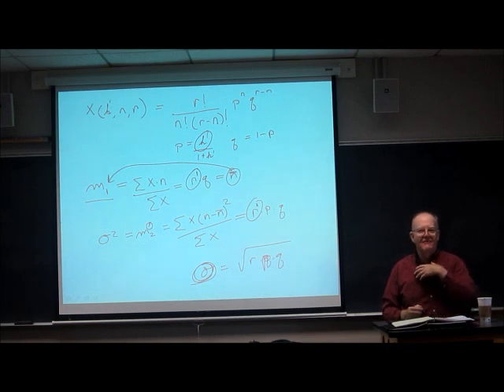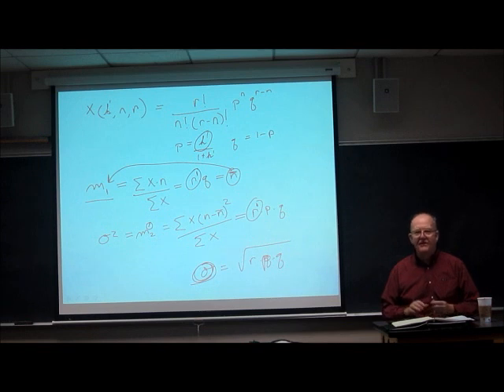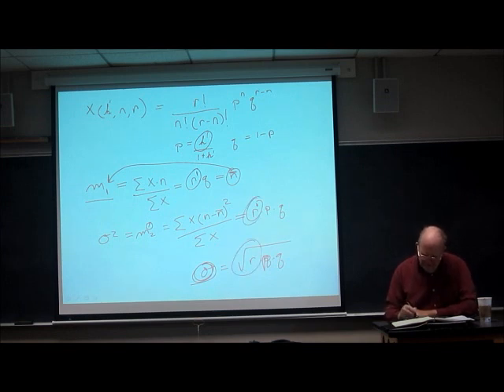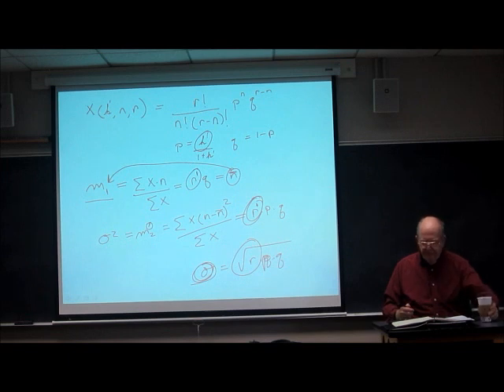At the end of the day, you'd be just as bad a mixture as at the beginning of the day. You can't do separations unless the stuff moves through space, moves apart faster than it gets wide. And because of this, we want a lot of plates, not a few plates. So this is one of the most important physical and mathematical reasons why chromatography works. Okay, we got to a really good stopping point.